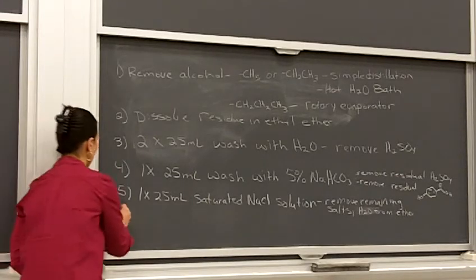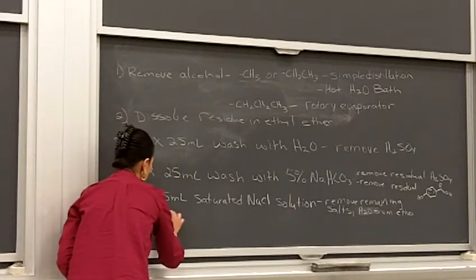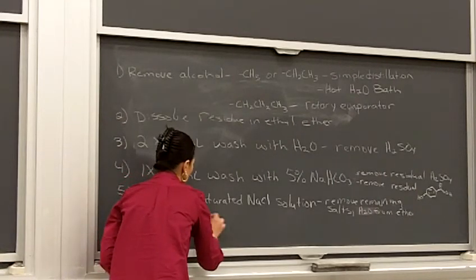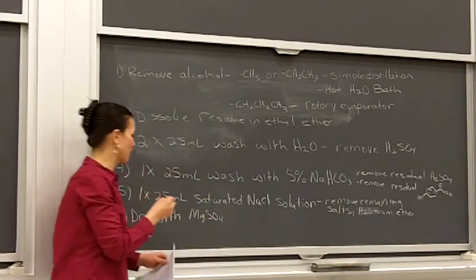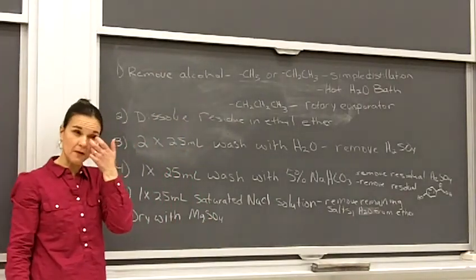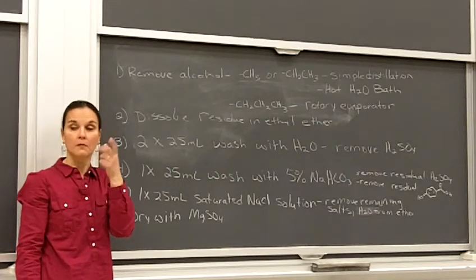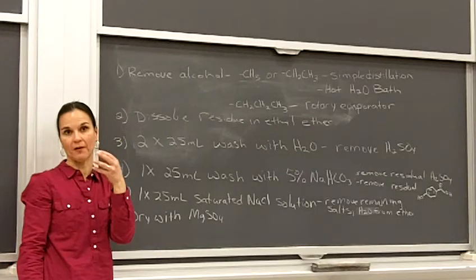Okay, so now we get down to our drying with magnesium sulfate. So what is that used again for? We'll put it in our ether layer, right? We're going to dry the organic layer with our magnesium sulfate, okay? How much magnesium sulfate do you add? Free floating, and that you have some clumping with a little bit of free floating, right?